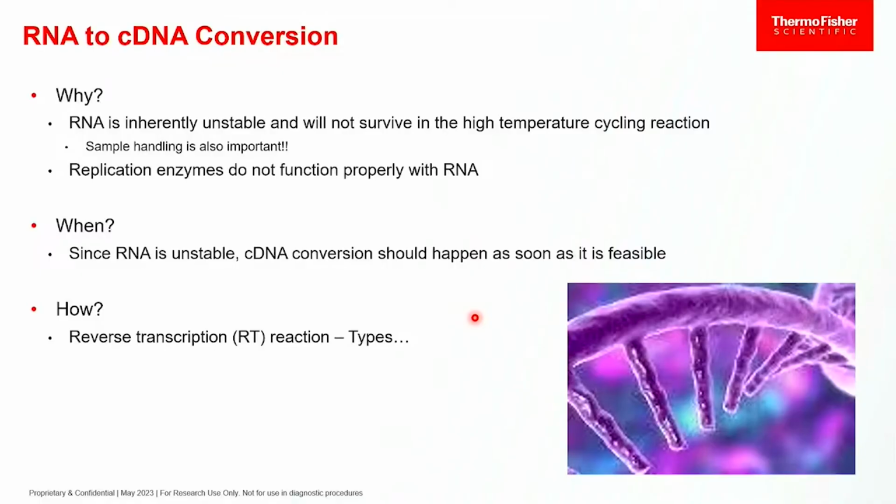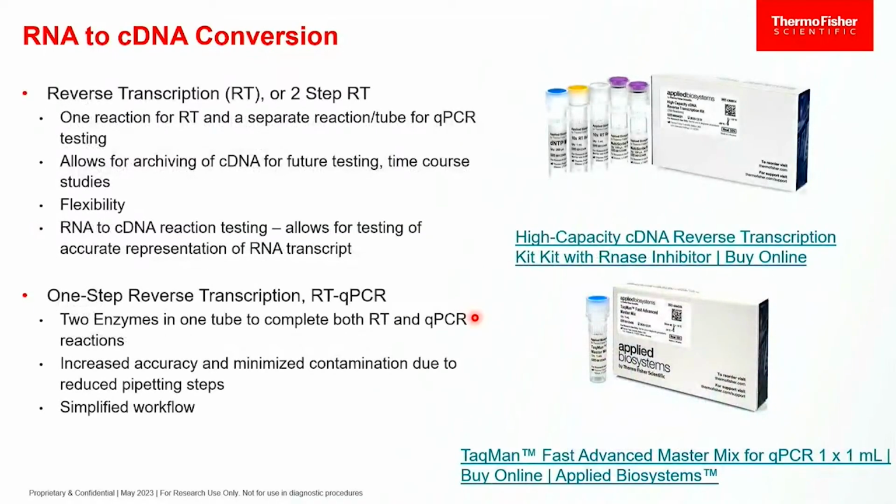So in order to start this off correctly, we are going to take a first pass and make a 1 copy pass and turn our RNA into cDNA. C as a copy, okay, it's copied DNA. And we can do that independently, using prepared mixes.